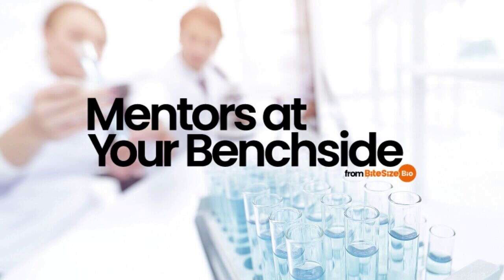Also, if you are performing a one-step RT-qPCR, the reverse transcriptase will use the reverse primer to prime the transcription reaction. In this scenario, a poor primer would result in both inefficient reverse transcription and inefficient amplification. Considering this, it's well worth spending the time necessary to design good quality qPCR primers. The good news is that primers are cheap, so you can easily test several different pairs to choose the best ones for your experiment. The bad news is the primer testing requires time and patience, so the sooner you get a pair of primers working, the better.